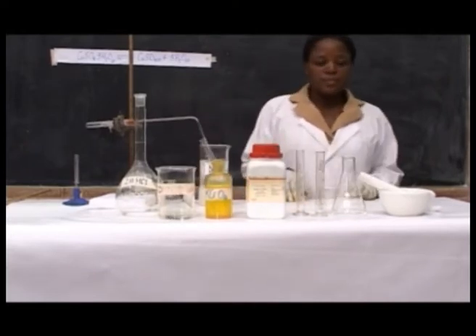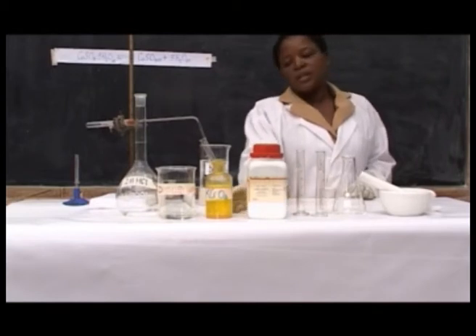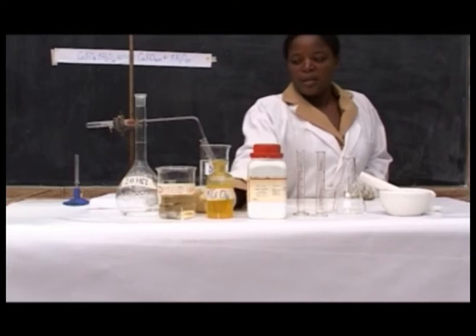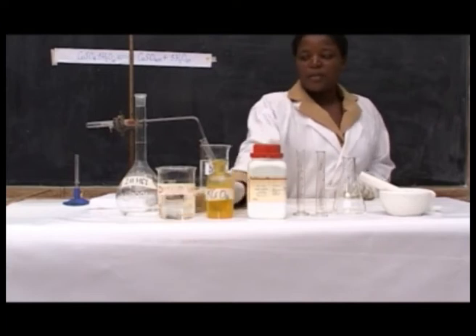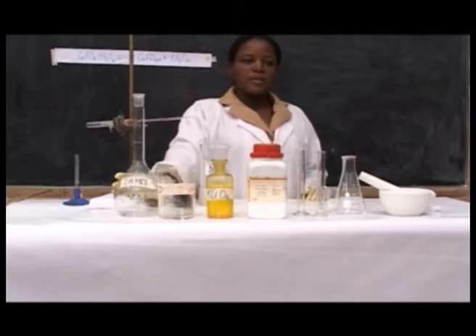Chemicals: hydrated copper sulfate, potassium chromate, distilled water, 2 molar hydrochloric acid.